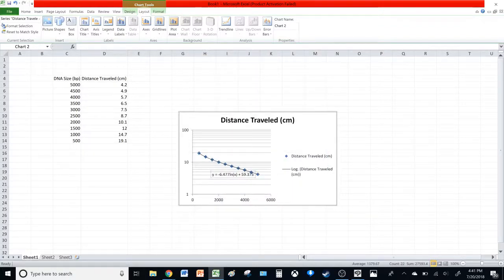So as you can see here, we have the equation right here. You can extrapolate the data on the graph, but I find that it will be a bit too inconvenient. Using the equation is much easier and much faster if you're adept with Excel, unlike me. Sadly, I'll have to calculate this with a calculator because I do not know how to rearrange equations in Excel.